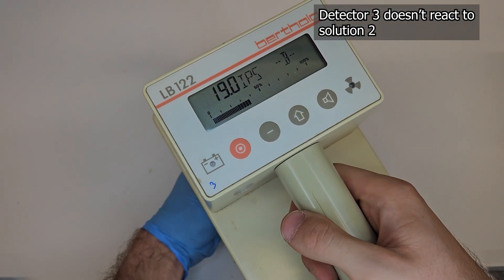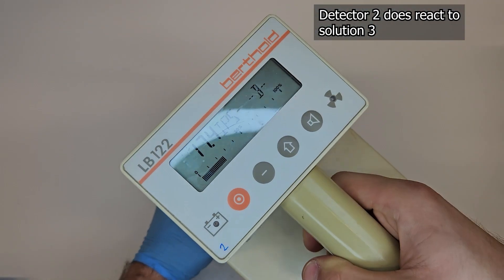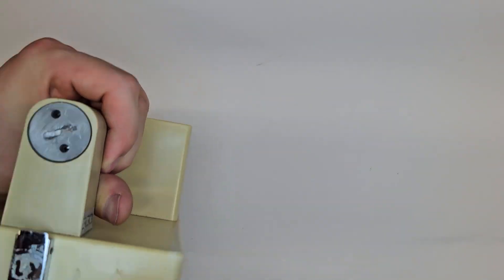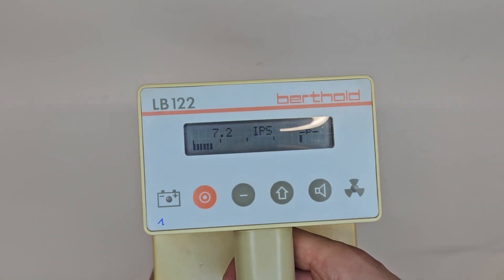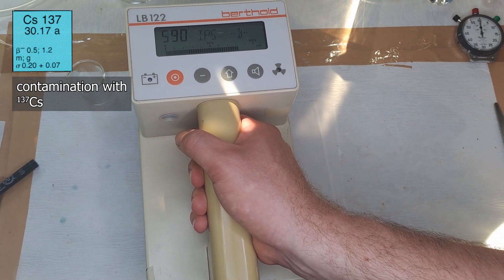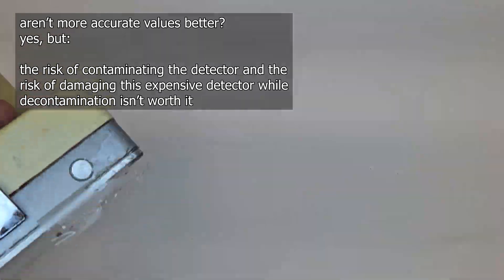Higher activities do penetrate the plastic, but the absolute value doesn't matter. What's important is identifying where the contamination exists — not really by how much. This means that when working with sulfur-35 during the practical course, we must remove the plastic wrap to get more accurate measurements. With a plastic wrap, the detector reads a maximum of 24 CPS on the stock solution; without the wrap, it reads 38 to 39 CPS. Without the wrap, it also detects that solution 2 is active. So why do we use a plastic wrap at all? We rarely work with sulfur-35, but rather with high-energy beta emitters that sometimes also emit gamma radiation — these are guaranteed to be detected. But cleaning a contaminated detector and risking damage to the thin aluminum layer isn't really worth it, so we use a plastic wrap as a pragmatic choice to prevent direct contamination of the detector.